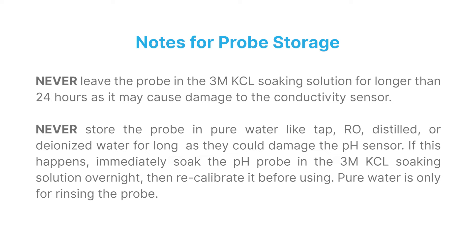Never store the probe in pure water — tap, RO, distilled, or deionized — for long periods, as they could damage the pH sensor. If this happens, immediately soak the pH probe in the 3M KCL soaking solution overnight, then recalibrate it before using. Pure water is only for rinsing off the probe.